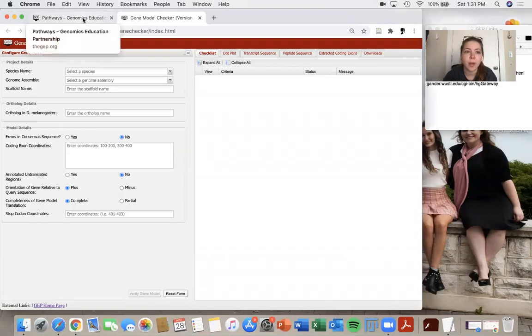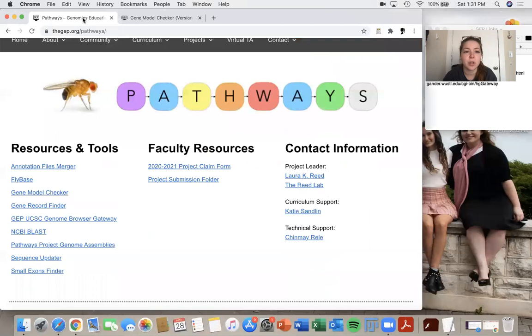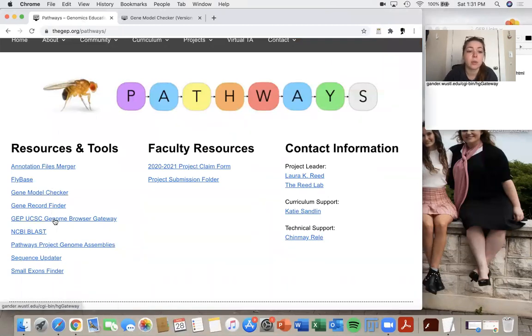We're going to go back to the pathways project on the GEP's website and we also want to look at the GEP UCSC Genome Browser Gateway.